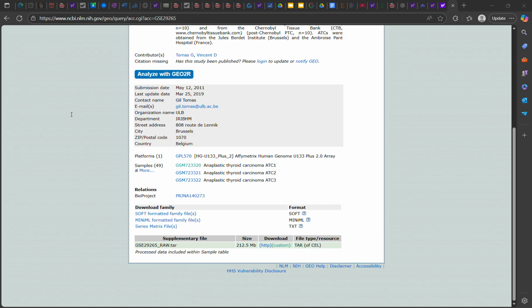Now we have to normalize the data. Normalizing the data is really important because it makes sure that you can really tell the difference between gene expressions, between the gene expression for one specific gene under different conditions. So basically, you really want to normalize your data by gene when you're talking about this kind of gene expression data. And this is what it's going to be. It's going to be basically the normalized raw data, and it's going to be stored in normalized data.